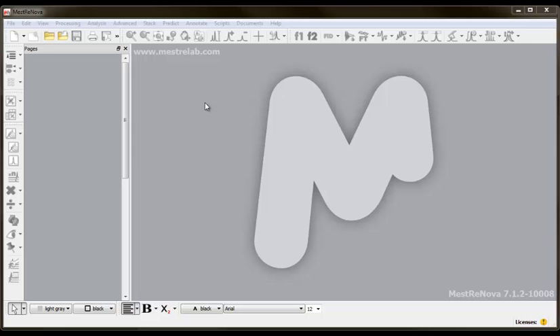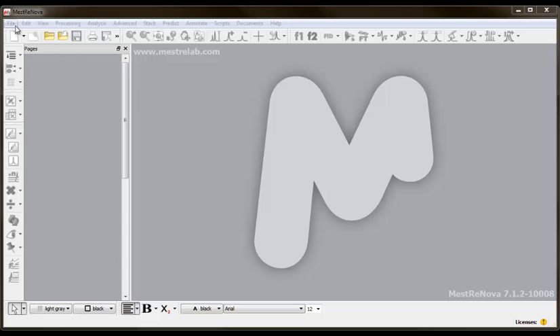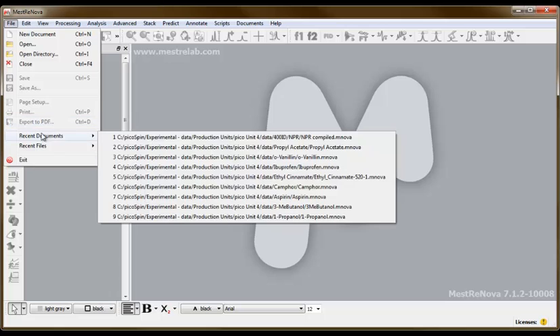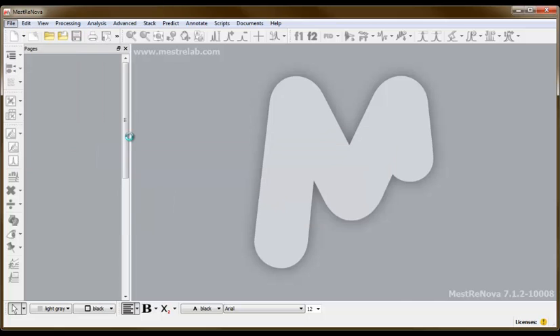I want to show you how to enable this option and set the macro. First, open a spectrum file. You can import an unprocessed dataset or a saved MNOVA file.